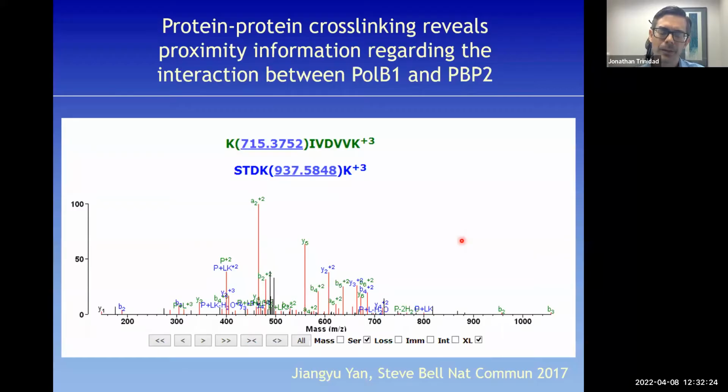Somewhat anecdotally, what we've noticed is a tendency when we have cross-linked peptides for one of the peptides to give us a really nice fragmentation pattern at the expense of the fragmentation pattern being intense for the other half of the crosslink. And that's obviously unsatisfactory. Knowing half of a crosslink doesn't really get you where you want to be. And again, this is somewhat anecdotal.